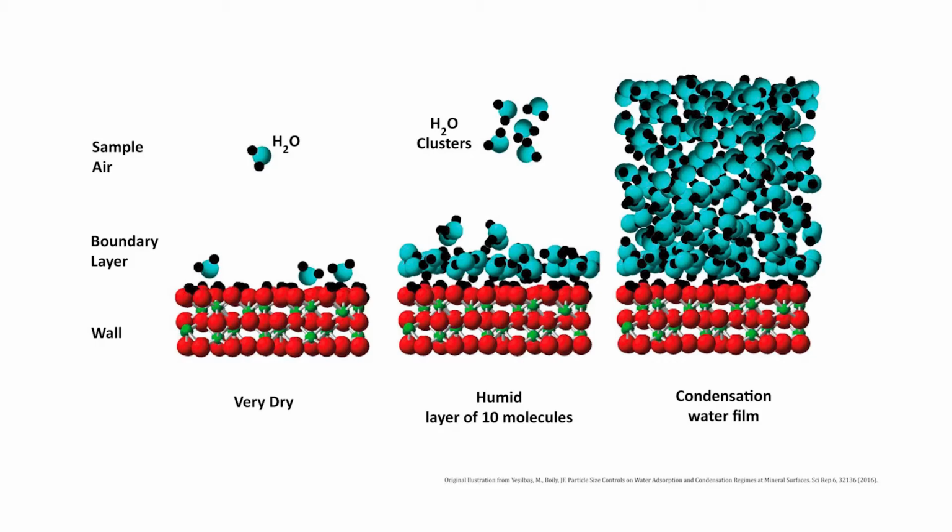When we even have more humidity, it might be too wet, and we will get a thick layer of humidity on the wall, and humidity will go into a fluid state. I mean, there is a water film there or drops. Please avoid that. The sensor will not work, and after a while it will be polluted. I mean, it's an optical sensor and it needs a clear view.